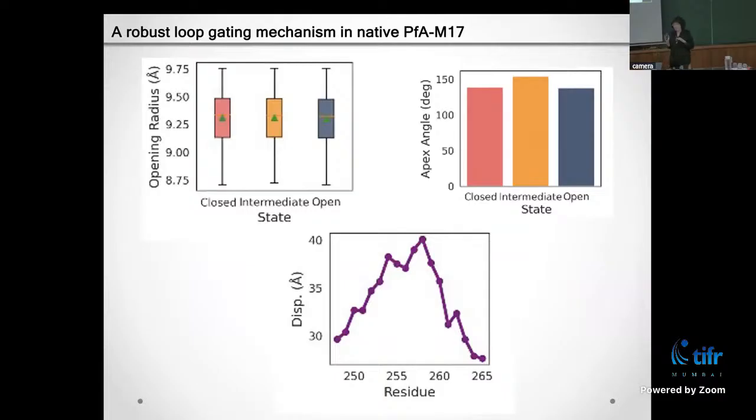But there is this very interesting interconversion. So it appears to move from open to closed to intermediate. And what is very interesting is we can capture these within the same structure. If we do not impose symmetry in the C1 structure, we can actually capture in different monomeric subunits the open state, the closed state, and the intermediate state. So all of these three things can be captured in the same structure in a cryo-EM map of what we are seeing in dynamics.